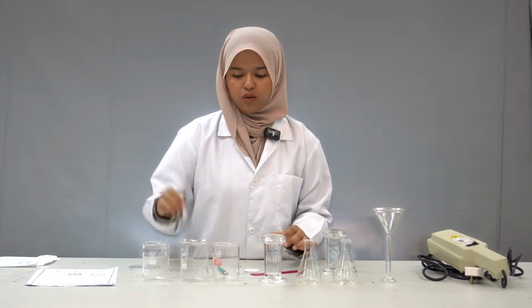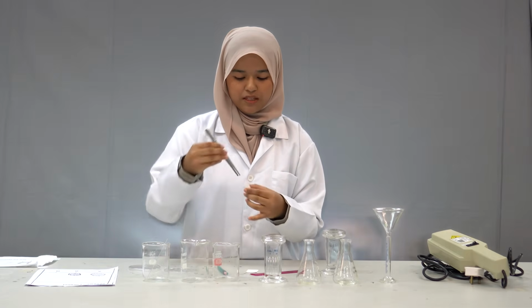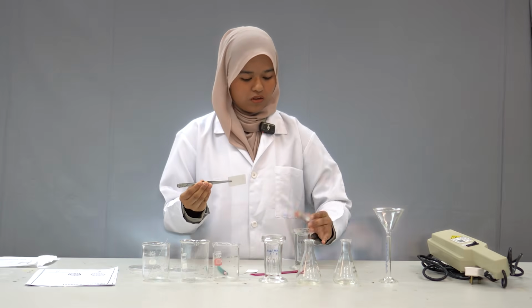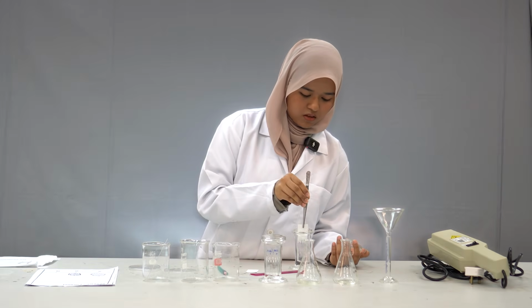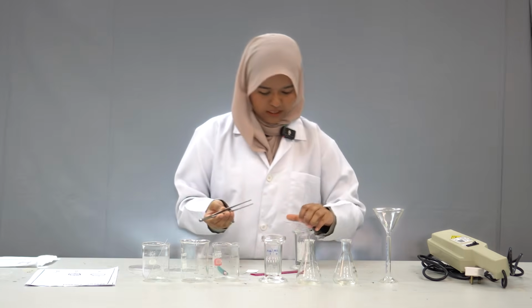And then we will use a forceps. Then we will put our TLC plates inside of our developing chamber. We need to put it vertically. Make sure it is straight like this.